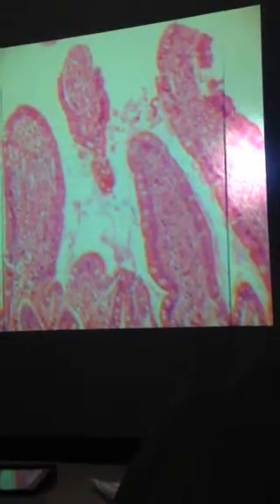What are these? More intestinal villi. That's the same picture. Yeah, I'm saying deja vu. All right. High mag of a what? Trachea. It may not be the trachea. It might be a bronchus. Remember, some bronchi will have pseudostratified columnar epithelium. So I would take trachea and I would take bronchus. There's not enough evidence to tell me which is which.